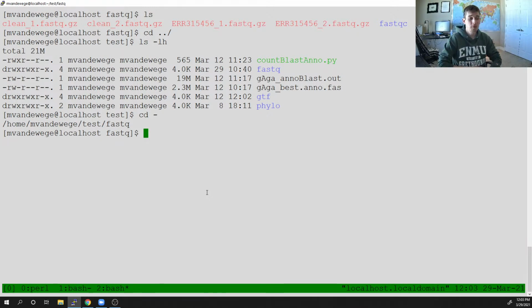So that's what we're going to do first, because either way we're going to have to map reads back to our reference, but if we don't have a reference, we're just going to make it. So currently, I'm going to assume that we don't have a reference. Even though this is human testis, normally, if I were doing this for real, I would just map it back to a reference and be done. But for all intents and purposes, we're going to construct an assembly.